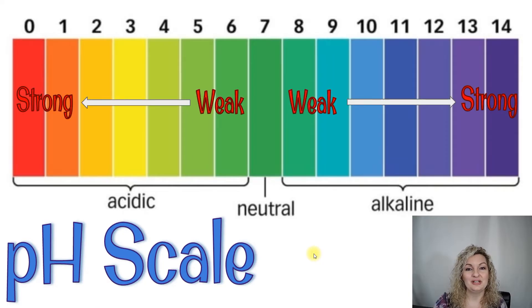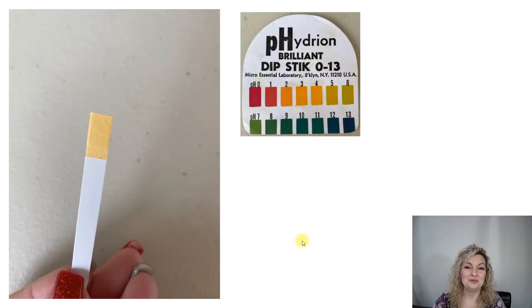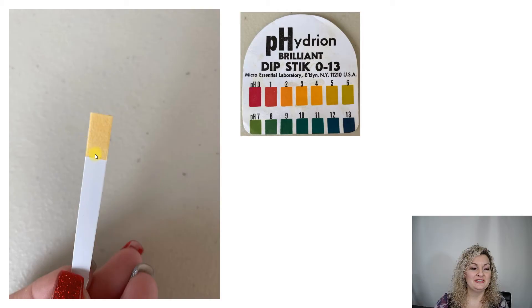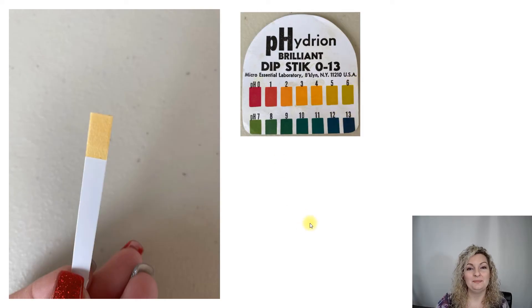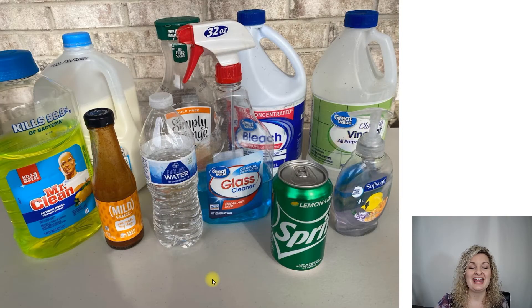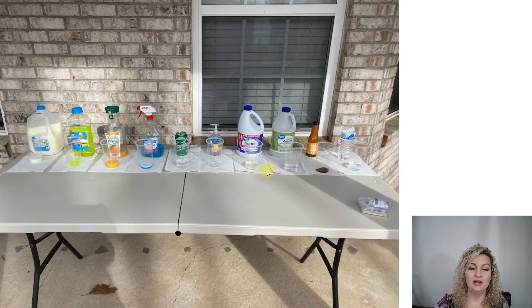So what we're going to do is look at lots of different things to test our pH today, and we're going to do it with this paper. This is called pH paper. You can see that on the end we do have an indicator on it, and when you dip it in the substance it will turn colors. It's going to turn one of these colors, and you can put that stick right up against it to try to figure out what color it best matches, and then you can see the pH level right above it to get a really good estimate of what the pH is for that particular substance.